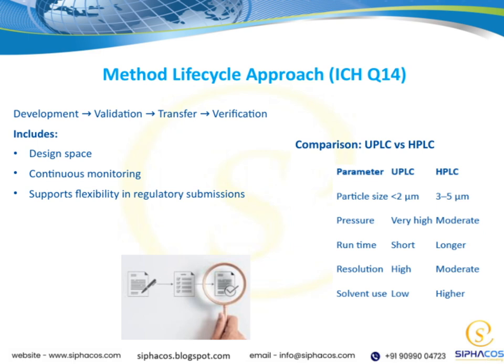Continuous monitoring is another critical aspect, especially with UPLC, as it enables real-time insights into product quality and process performance. This aligns perfectly with the modern need for agile and responsive manufacturing. Overall, adopting UPLC within this lifecycle approach offers greater flexibility in regulatory submissions.